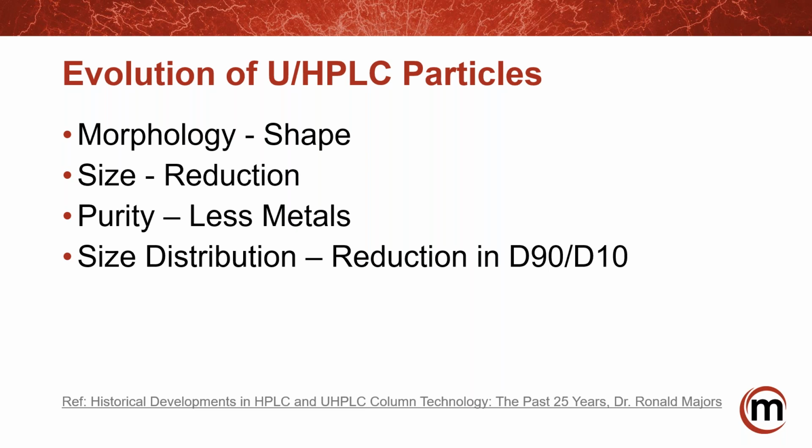You had the morphology of the particles, which talks about how the particles were shaped. You had irregular, and now spherical. You had also the size of the particles. Over time, we've had the size really reduced from early 100 micron down to now even 1.3 micron particle sizes.